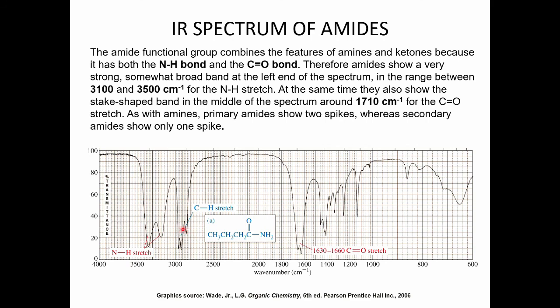So that's pretty much all of the major functional groups of the IR spectrum that you'll need to know. Again, when you analyze an IR spectrum, the peaks can shift a little bit. So if you know something should be there, but the peak is a little bit lower or a little bit higher than you would normally think it could be, it could just be something with the molecule, and it could actually be the right peak.